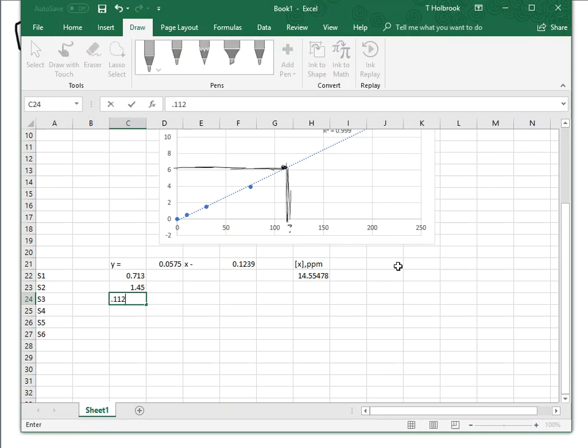This one was a 0.114 or 112. This one was a 15.4. This one was 8.44. This one 3.46. Do I have to do it every time? The answer is you can, but no one wants to take the time to do all of that, right?